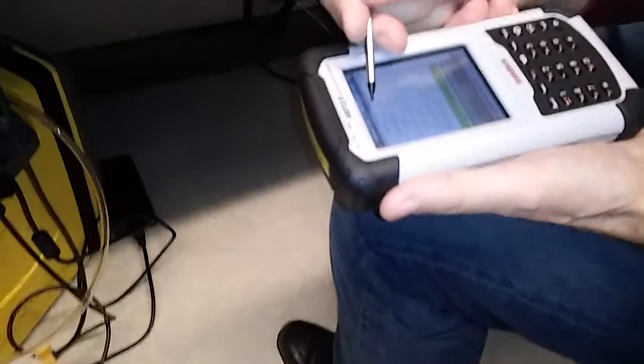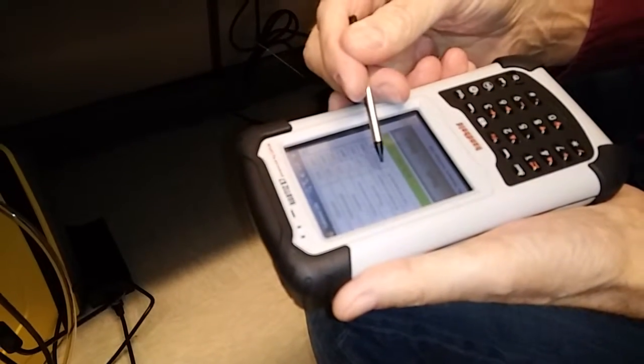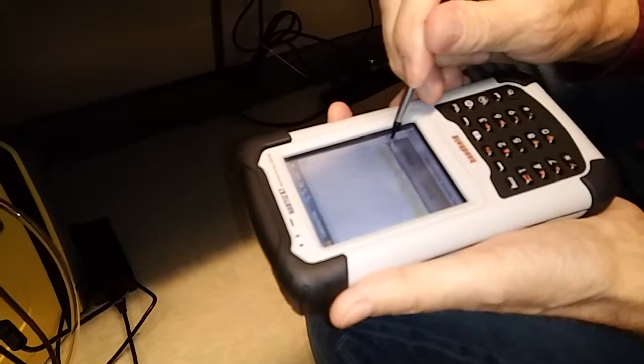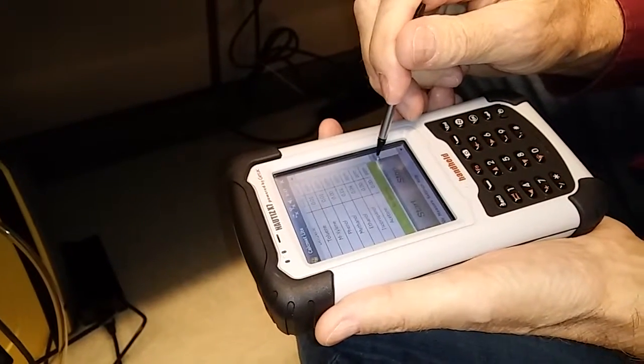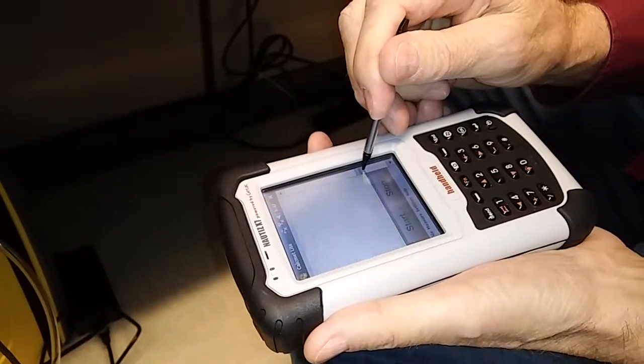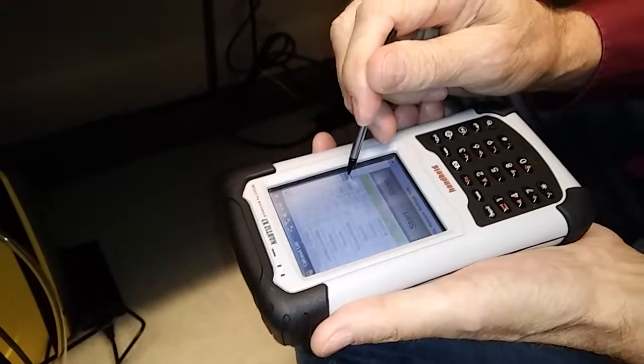It measures ethanol, isopropanol, acetone, dichloromethane, phosphine, and then, like I said, up here, xylene, toluene, methanol, ethanol. Almost zero. Well, they should all be zero if we've got nitrogen.